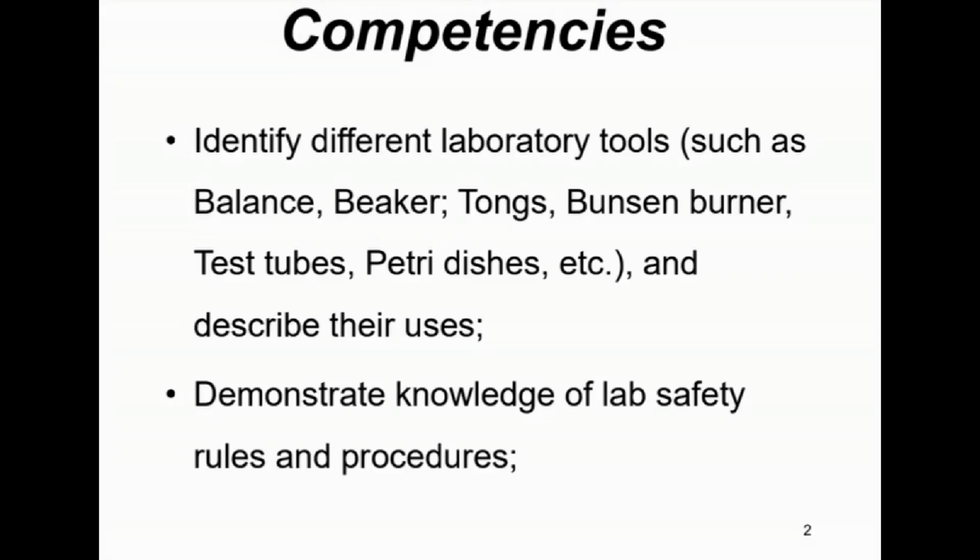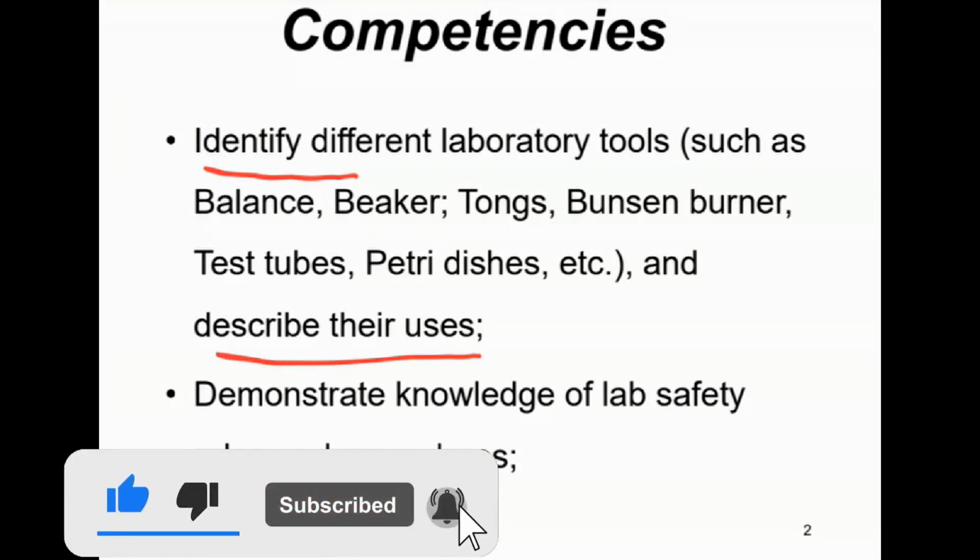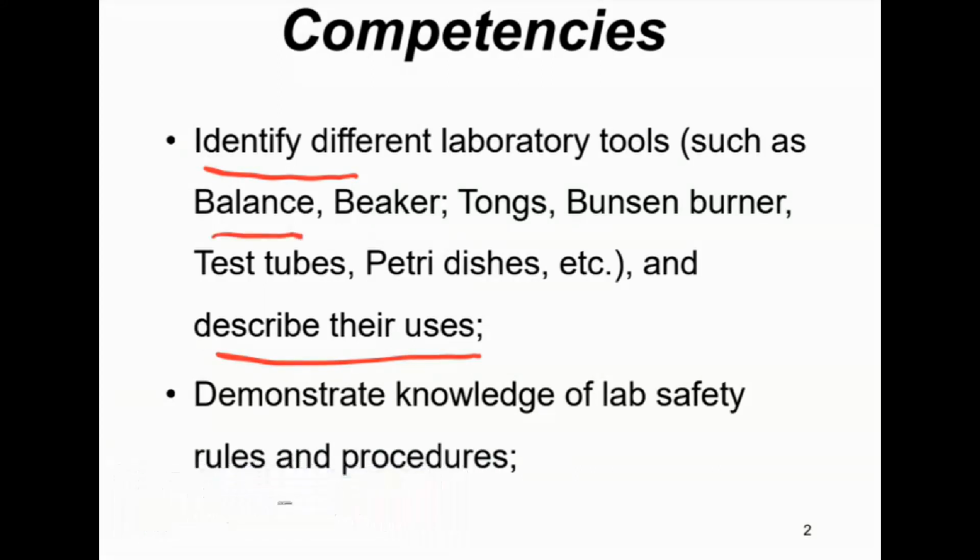So in today's lesson, I will explain how to identify different laboratory tools and describe their uses, such as balance, beaker, tongs, Bunsen burner, test tubes, petri dishes, etc.